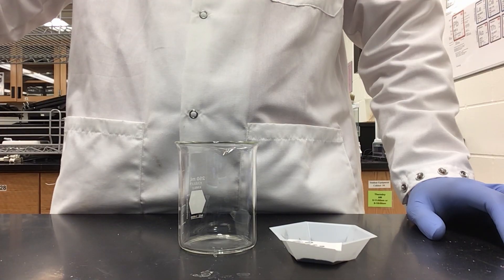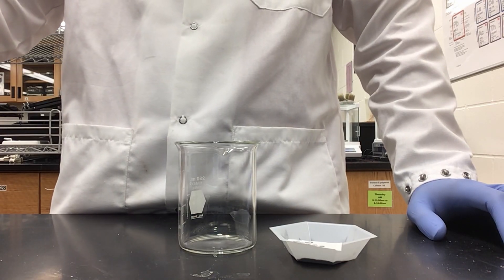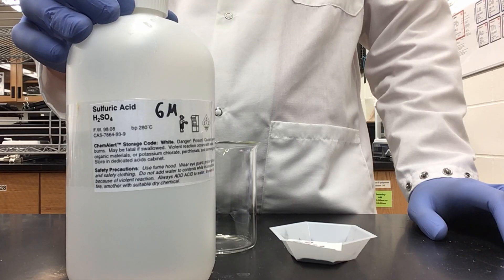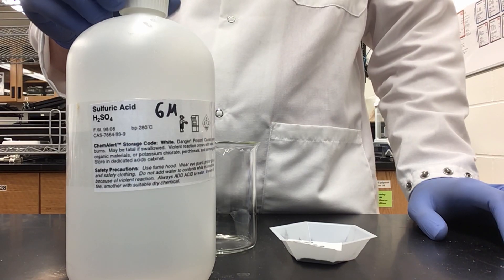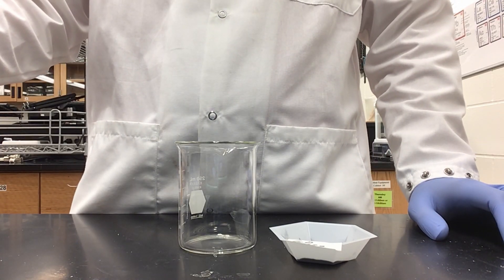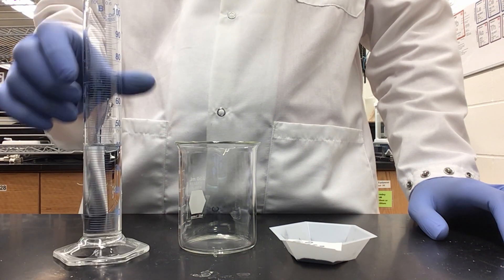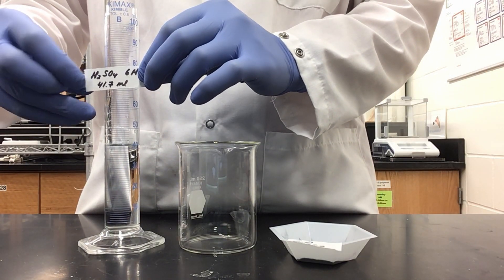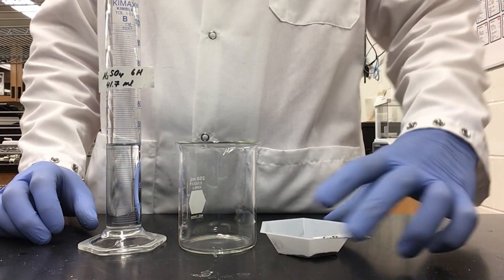We are using 0.05 moles of copper oxide because I want to produce exactly 0.05 moles of our copper sulfate product. Then we are going to need to add 6 molar sulfuric acid. You need to add an amount of sulfuric acid equivalent to 5 times the moles of copper oxide. So we need 0.25 moles of sulfuric acid, which gives us 41.7 ml of 6 molar sulfuric acid — exactly 0.25 moles.